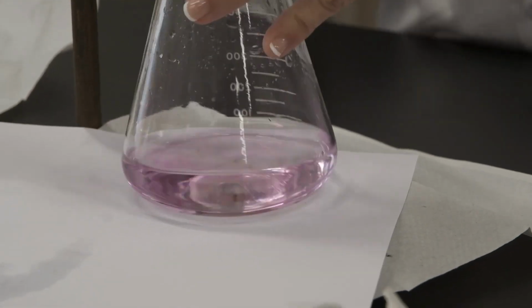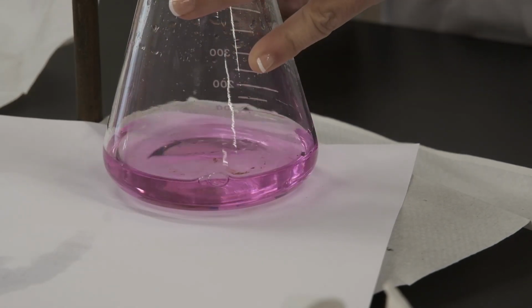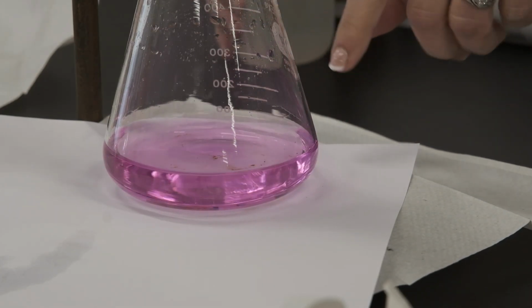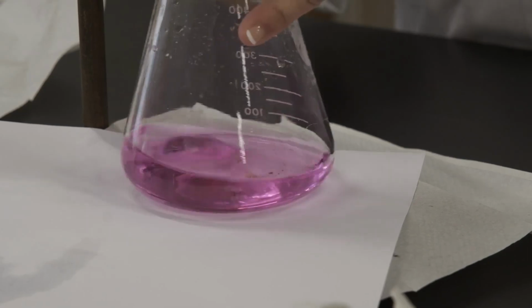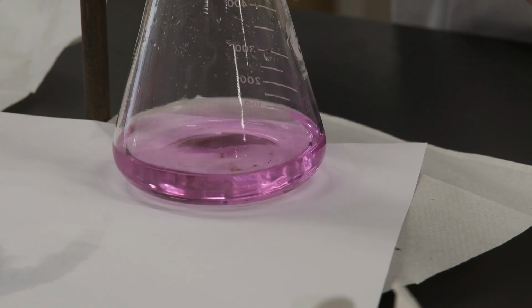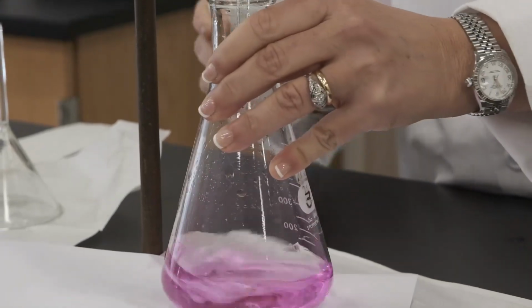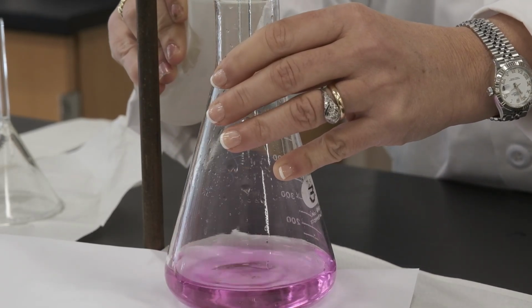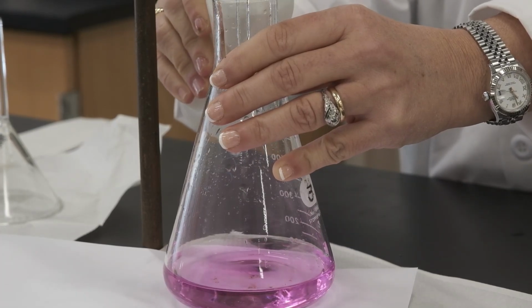When the solution becomes pink, keep stirring. And if this is too pink, it should be a more faded pink. So when you're seeing the persistency of the color, instead of adding the solution from the burette, use the bottle to wash the solution, to clean the walls of the flask and to collect the one drop that is attached to the tip.